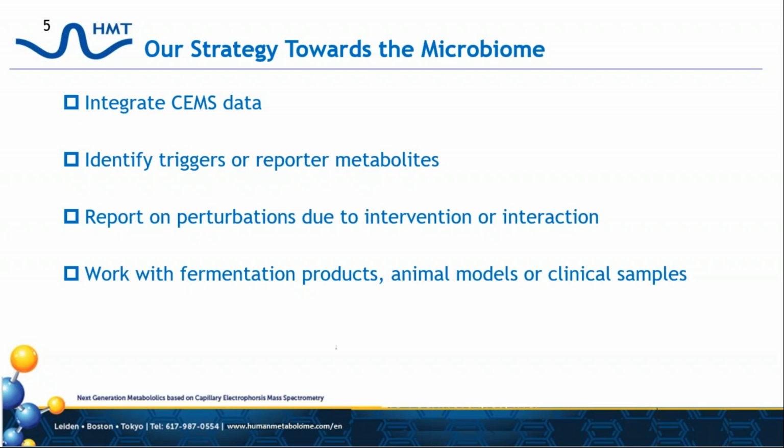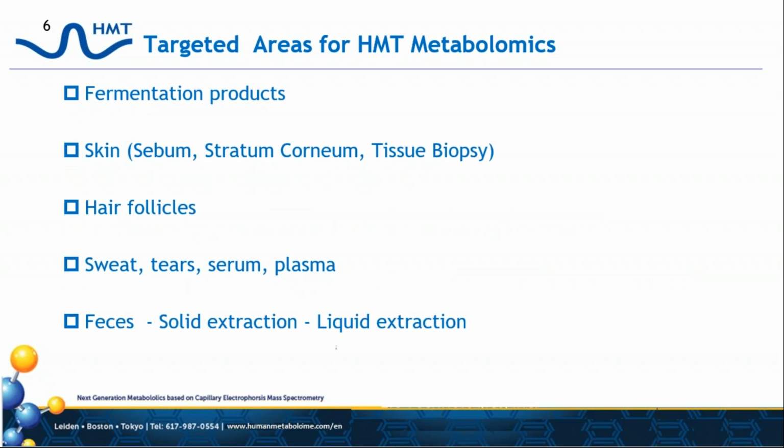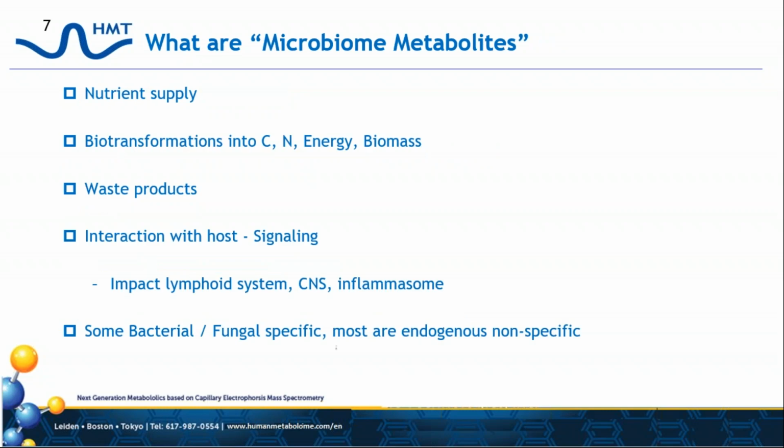these goals. Our targeted areas include, again, fermentation products, skin and skin tissues, hair follicles, sweat, a lot of each of those biofluids, tears, serum, and plasma, as well as look at fecal matter, both solid extraction and liquid extraction, depending on the type of microbiome that might be of interest.